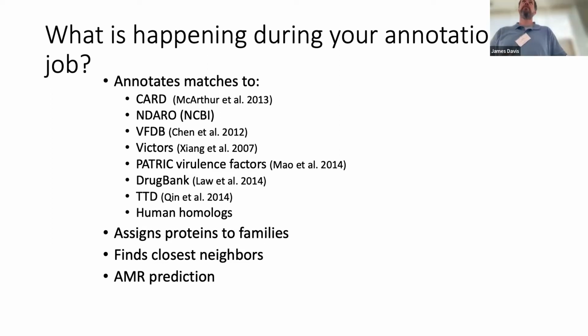This is an ongoing research and development area of interest in our group, and it's of particular interest to me. Right now, we have a set of machine learning classifiers that will predict susceptibility or resistance to a variety of antibiotics for a select set of well-studied organisms. And those include strep and staph, salmonella, mycobacterium, a few others. The production system has an earlier version of our classifiers. It runs off of AdaBoost.